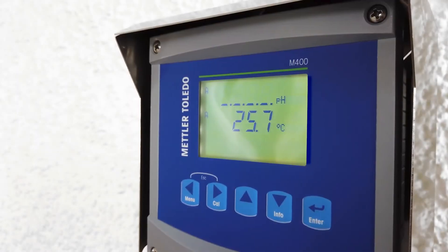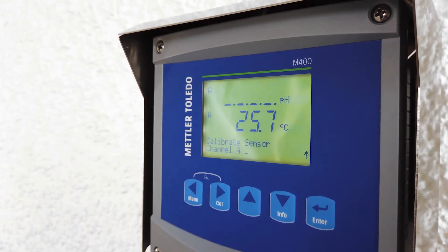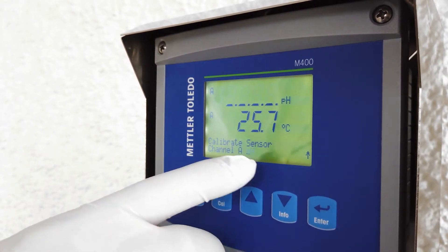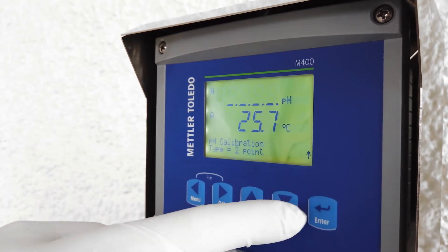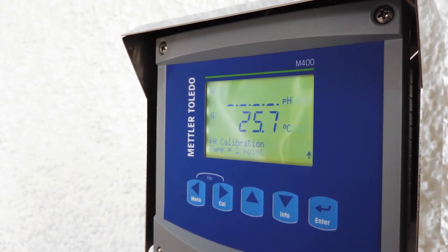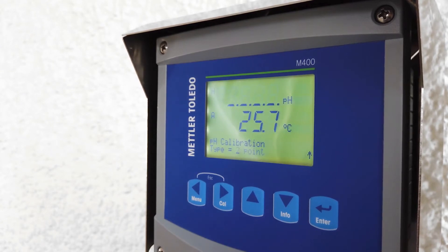On the transmitter, select the calibration menu by clicking on the calibration button. You will be required to pick the channel the sensor is connected to. Since this is a one-channel transmitter, you have only one channel, so select channel A. Then select two-point calibration and press enter.